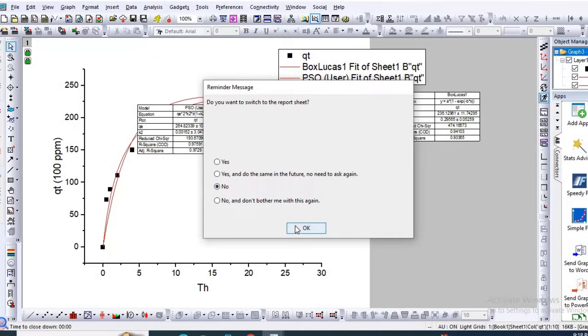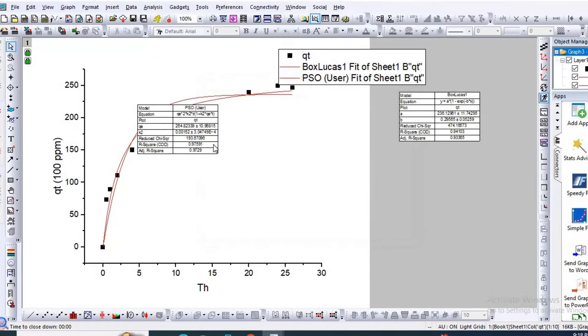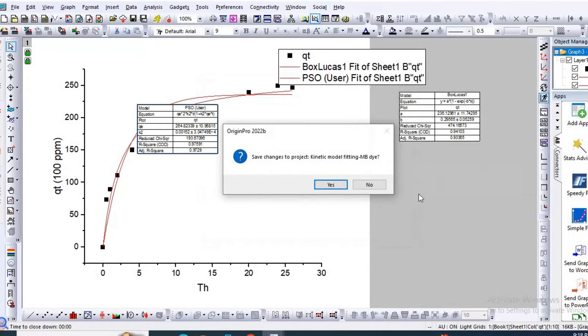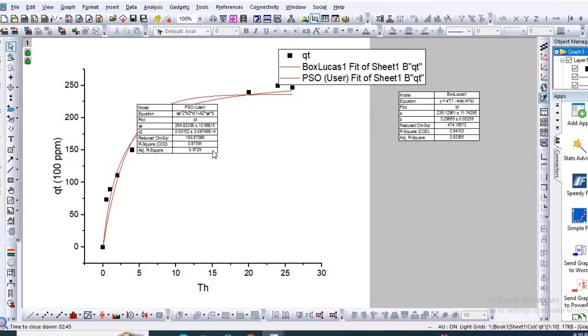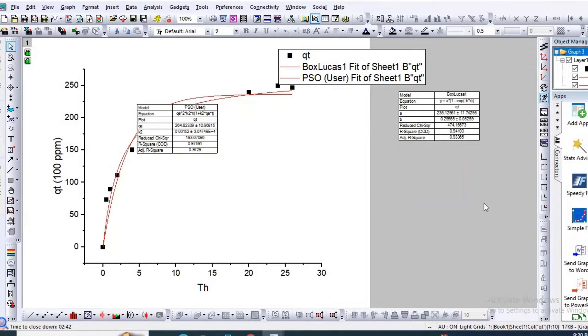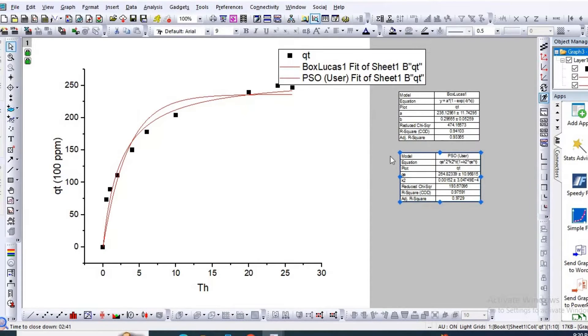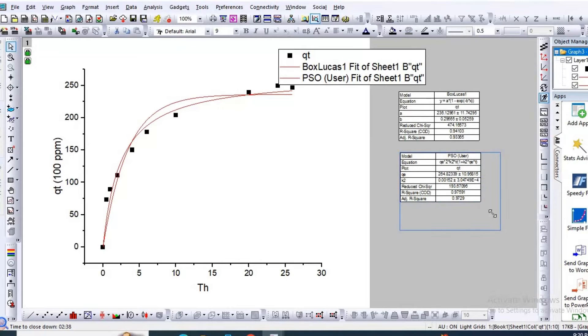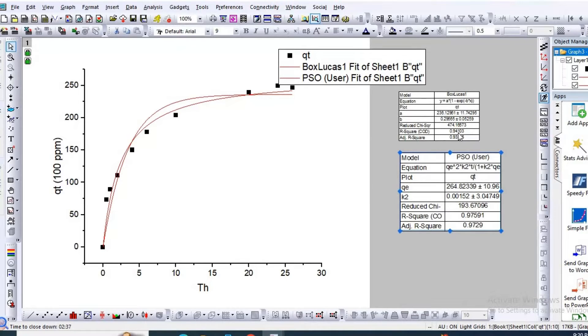Then No, then OK. So here is your pseudo second order fitting and here are the parameters.